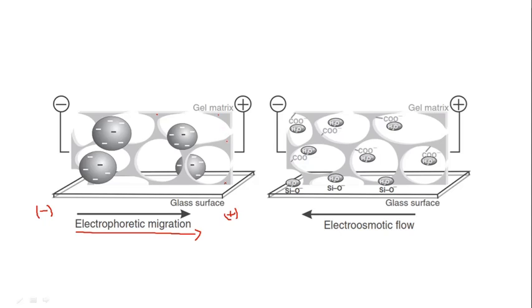The gel matrix contains some functional groups. When they get ionized, they propagate the anionic nature and are always attracted to the anode. Here it clearly indicates the carboxylic group. If you use starch as the medium, the medium contains carboxylic groups.